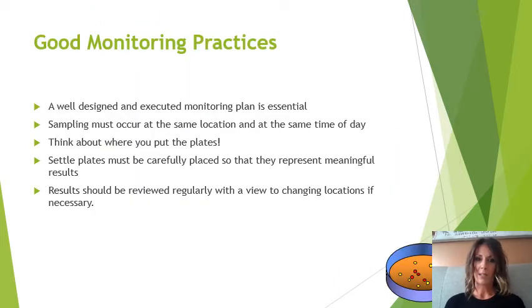Good monitoring practices: a well-designed and executed monitoring plan is essential. Sampling must occur at the same location at the same time of day. So you need to think about where you put the plates. This is really current. We need to be validating where we put our plates. They need to be relevant to our production process, to our equipment, to our personnel flow, to our workflow. So putting a plate for sampling in a corner of a room that never gets any production or any workflow probably wouldn't give us a representative sample of our process.